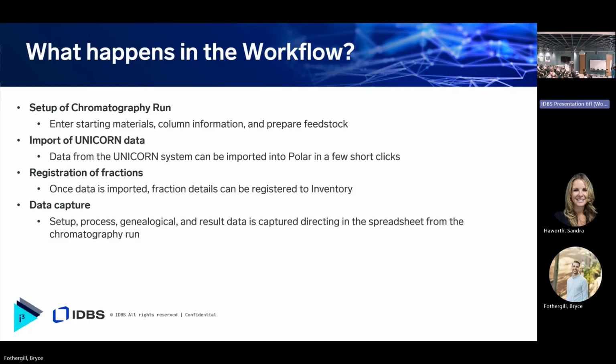First, we're going to set up the chromatography run and enter some starting materials, things like that. We will then import the Unicorn data directly into the spreadsheet. We'll register the fractions to inventory, and finally do some data capture.